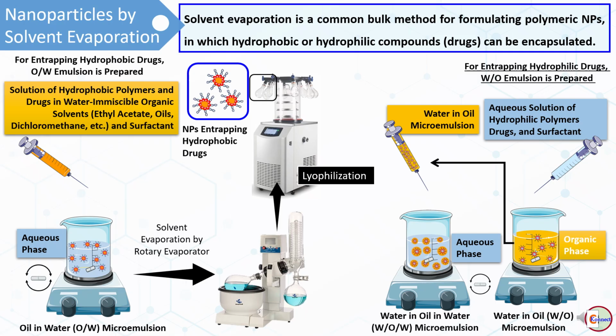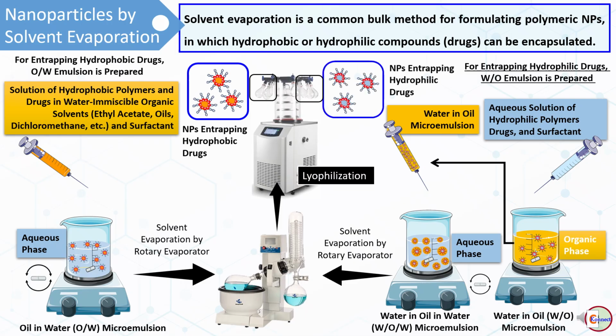This water-in-oil-in-water emulsion is transferred to a rotary evaporator for removing most of the solvent. Later, the final drying was achieved by lyophilization, yielding nanoparticles as a solid powder that entrapped hydrophilic drugs.